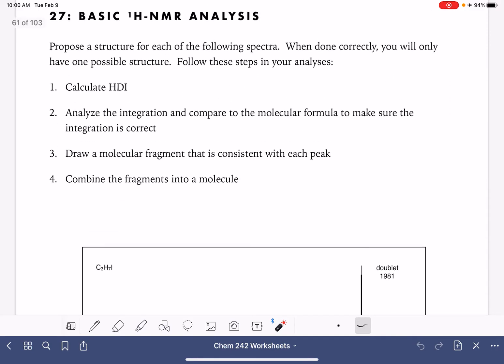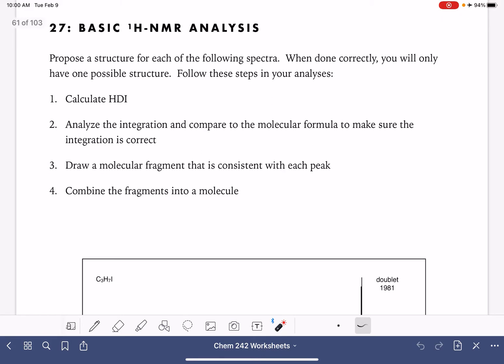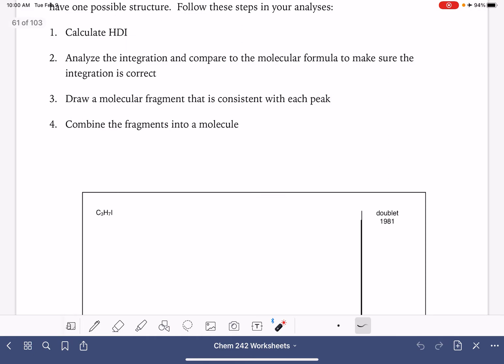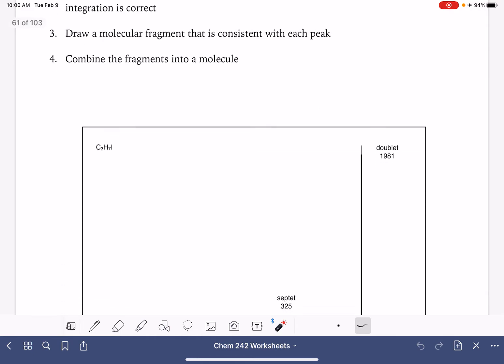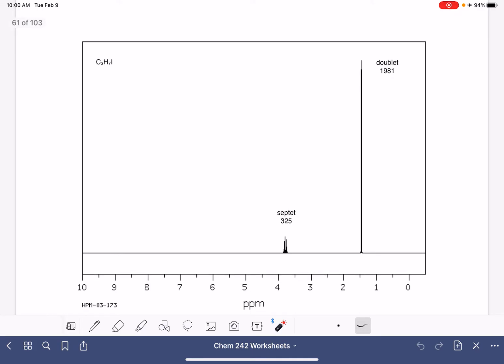The plan we're going to take: number one, start with the molecular formula and calculate the HDI to give us some initial information about presence of double bonds, rings, or things like that. Then we're going to look at the integration to make sure the integrals match the number of hydrogen atoms in the formula. Once we get the integration figured out, we're going to draw fragments consistent with the splitting pattern and integration for each peak, then put it all together to make one molecule.